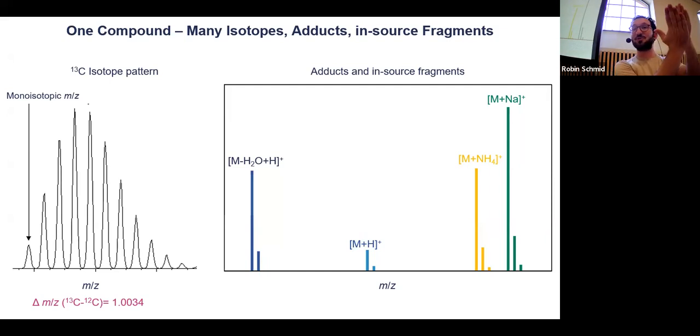And the same is true for dimers. Sometimes things just stack together, so you have some multimers forming in-source. So two molecules stacking together, and then one sodium, one proton. And you think you found something new, but it has the same retention time as all the other ions. And we're going to look into that.